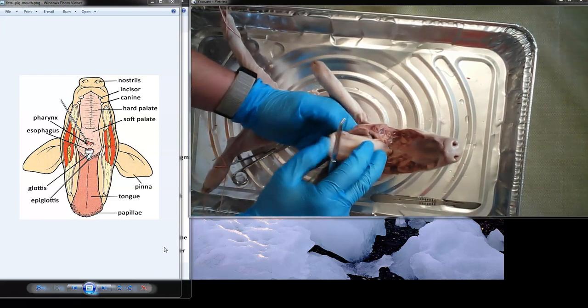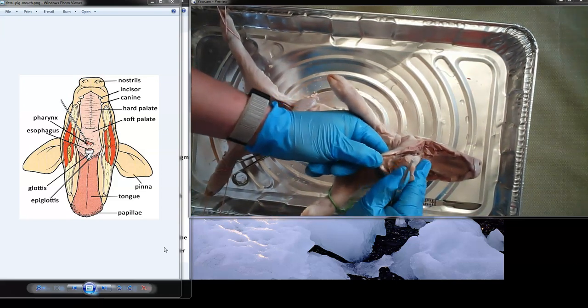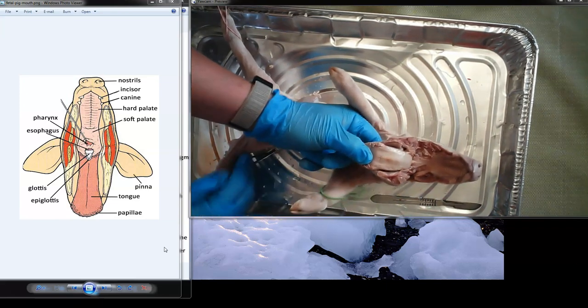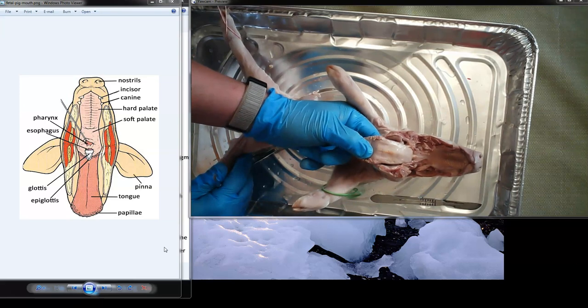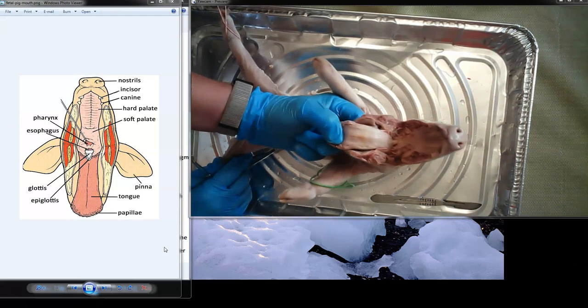Then here we have the tongue. It's very obvious. And then the bottom teeth underneath the tongue over there. So it has some bottom teeth as well. Yes. This is very gross. And if you put that tool into there, I see saliva coming out.